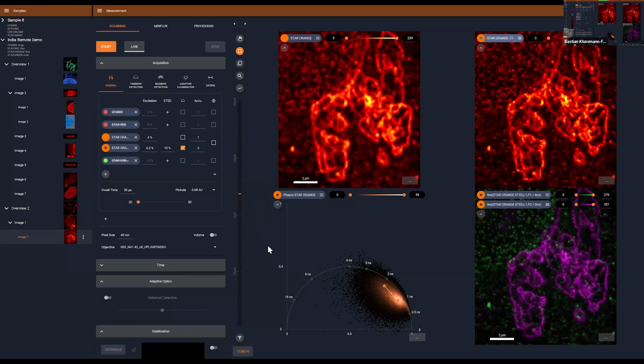So the matrix detector can do time-correlated single photon counting on its own. So you don't need any third-party hardware. At the moment, I did FLIM imaging based on our APDs, where we have an additional FLIM card here from PicoQuant.